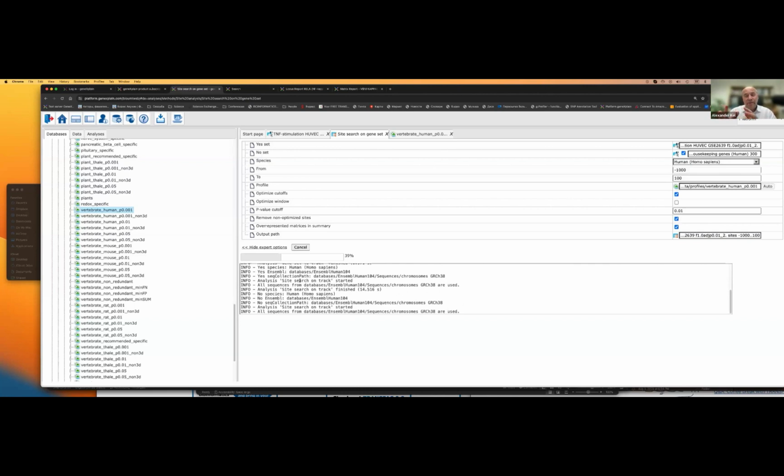Here we extract promoters based on the TSS, which is reported in Ensembl as the most upstream TSS of the gene, so actually the beginning of the first exon. That's the TSS which Ensembl reports as the most probable TSS.